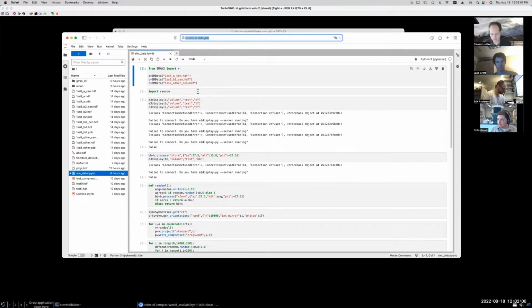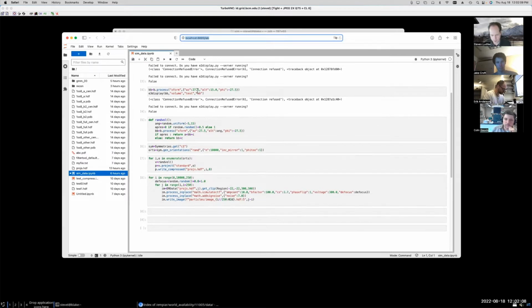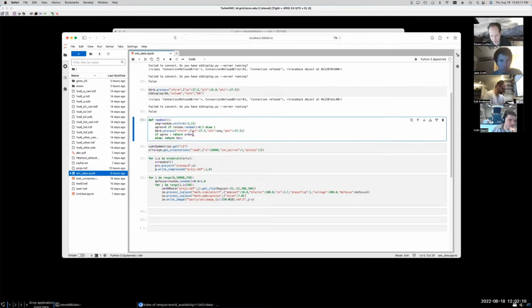Yeah, right. So in here, it said A plus B plus C, and B was the unrotated monomer, right? So we had one monomer that we were leaving out or putting in, so that was A, and then here we had B instead of BB.